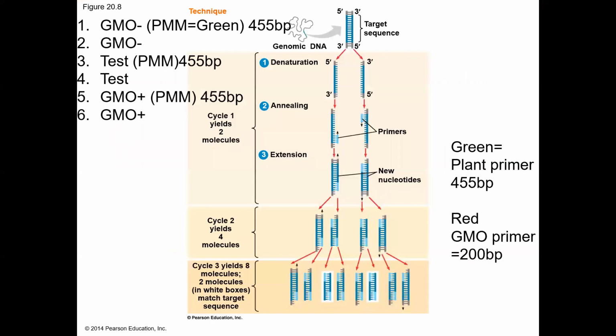For this slide here, I'm just going to use it to show the exponential growth. In lab, if we were having lab face-to-face, we would be talking about what's happening here with the primer, but since we're not using it, we're not going to consider it here. But in this picture, here's our target sequence of DNA. You're going to heat the DNA hot enough that it's going to cause the DNA strands to separate, and that's where the heat comes in.